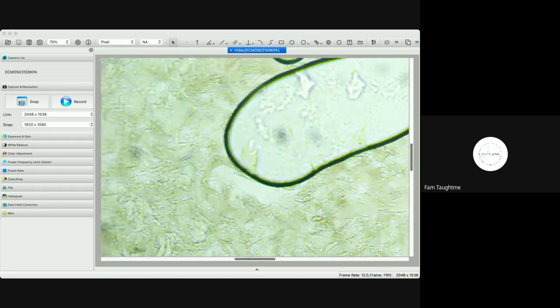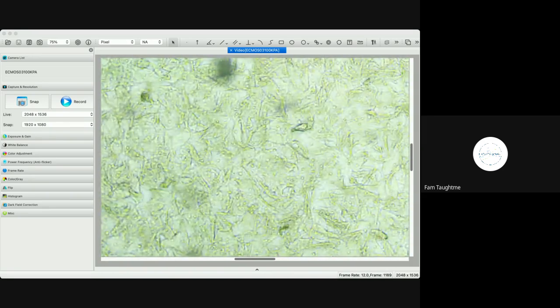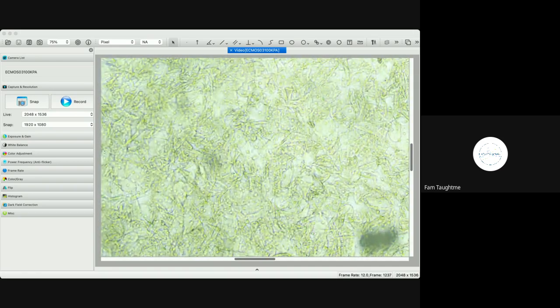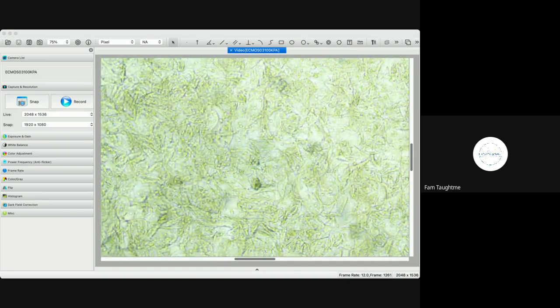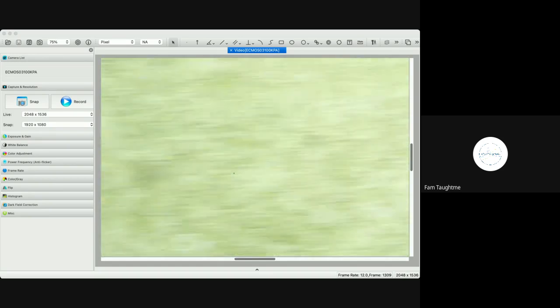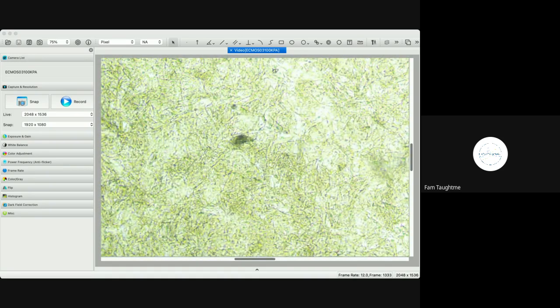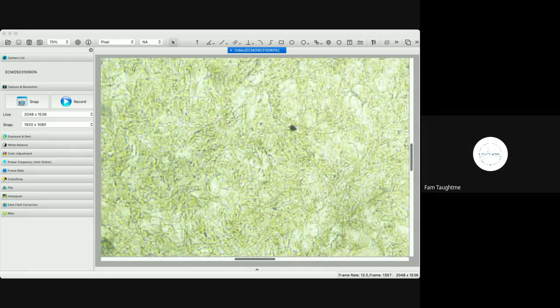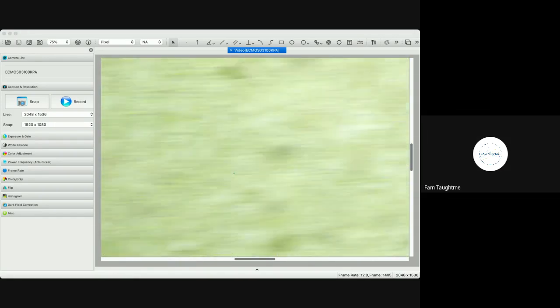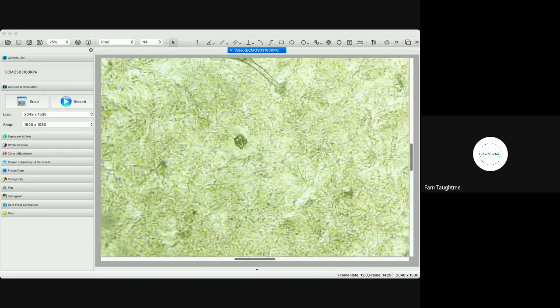This is a bunch of thick vaginal cells, kind of like that milky, solid discharge that you would see. A lot of that is this. What we call in fertility awareness is vaginal cell slough, and it can sometimes be confused with cervical fluid. So we try to teach people that those two things are different.